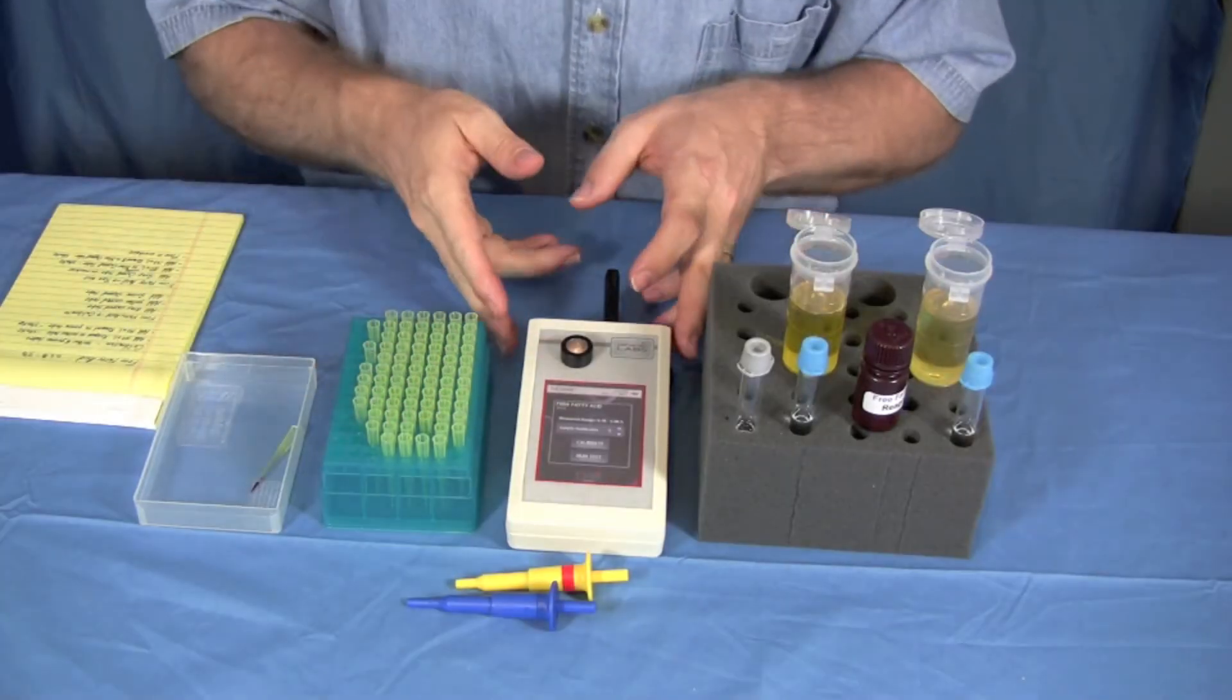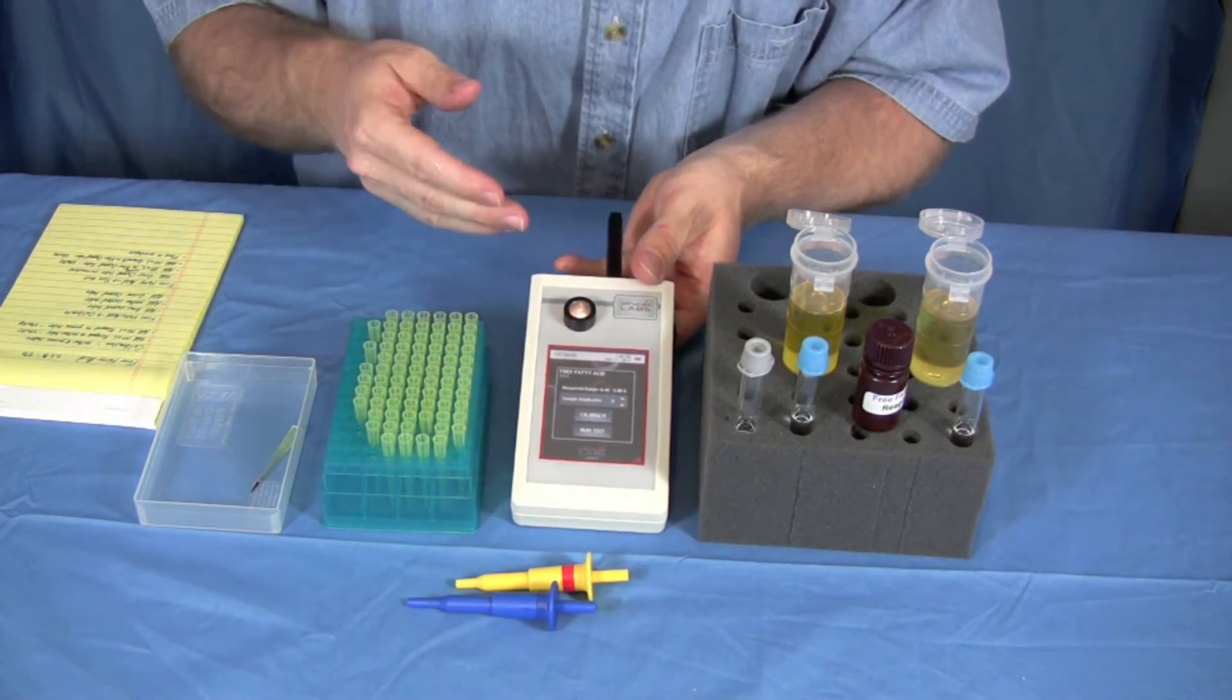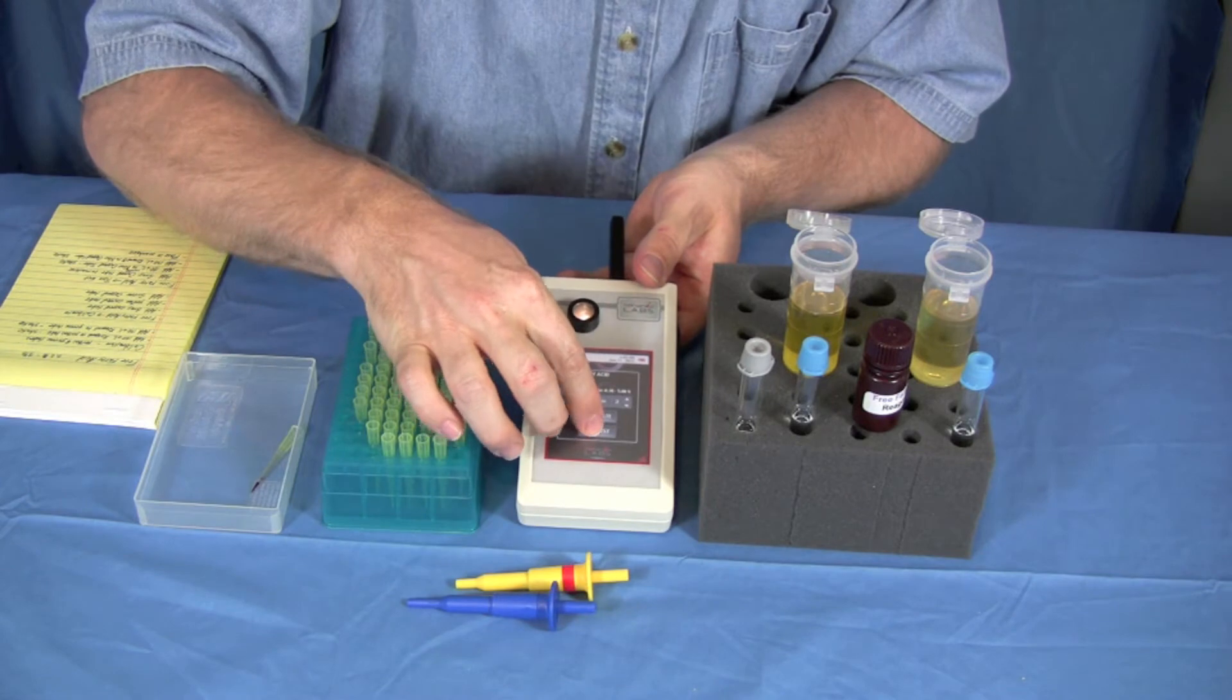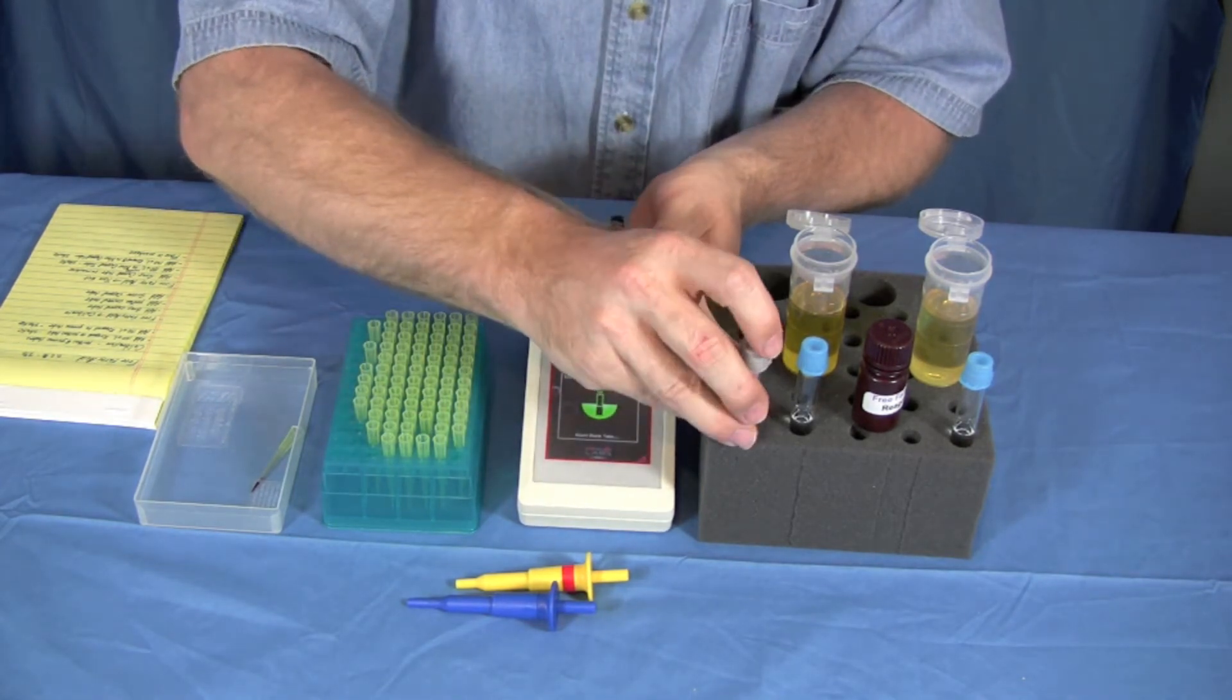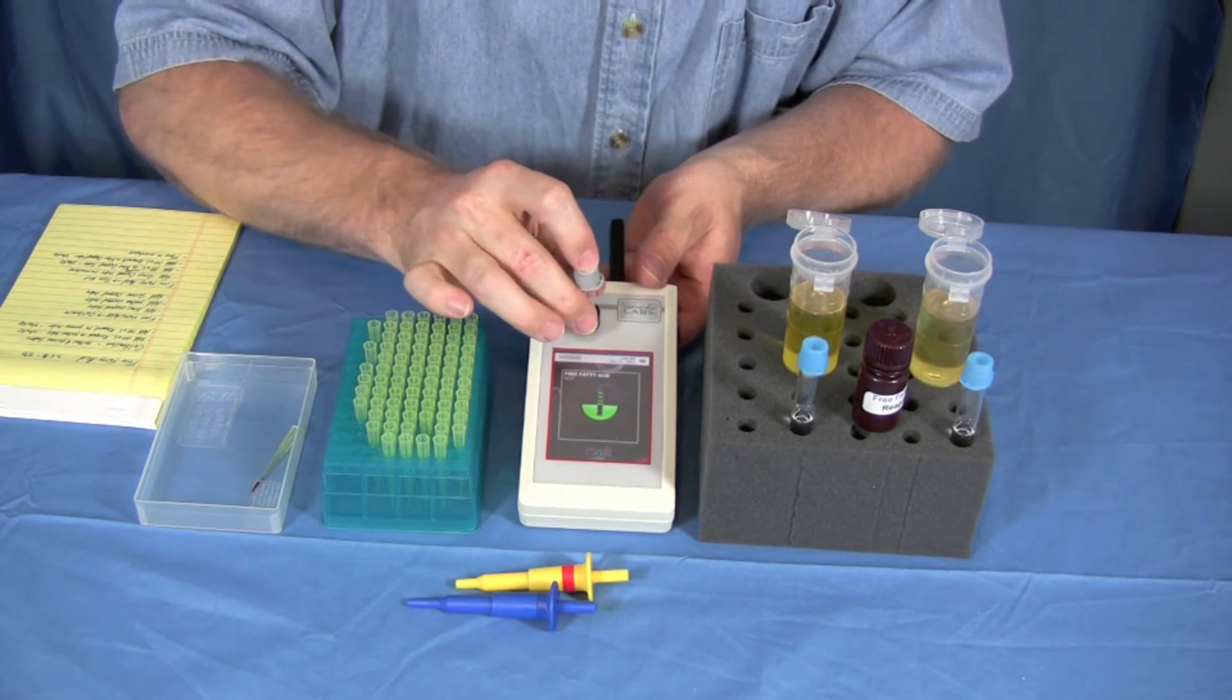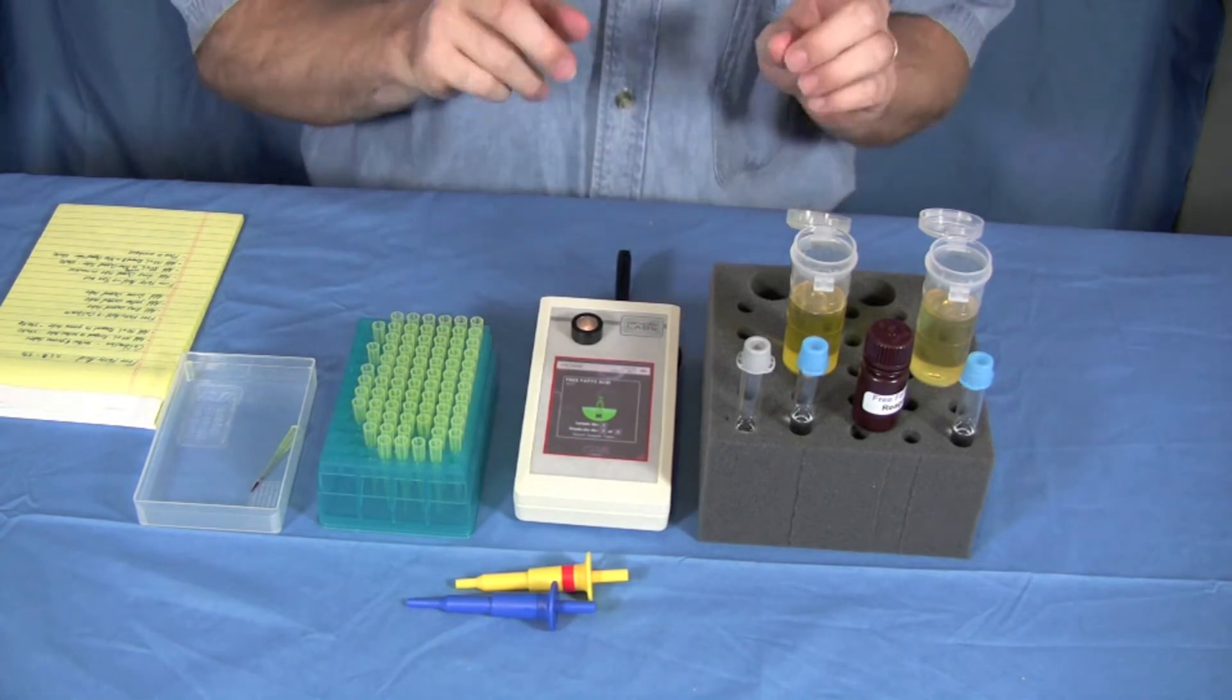To start a test it's real simple. You walk up to the machine, get it into the free fatty acid mode. We've already calibrated it so now all we do is choose run test. It asks us to enter the blank so we take the blank, put it in, pull it out. Now we're ready to do our test.